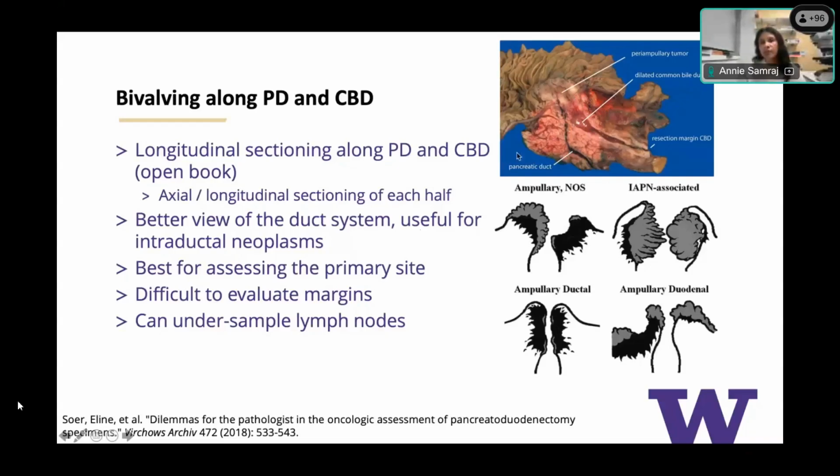So remember that the Whipple resection, you can do it not just for pancreatic neoplasms, but also remember we have the bile duct coming in here. So from the bile duct, you get cholangiocarcinoma, right? So it's not just for pancreas, but also for cholangiocarcinoma, and we have the ampulla here. So even for duodenal and ampullary carcinomas.